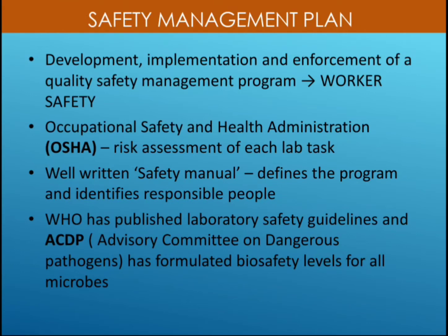Development, implementation and enforcement of a quality safety management program. Then the Occupational Safety and Health Administration, also called OSHA, requires risk assessment of each lab task. Then there should be a well written safety manual which defines the program and identifies the responsible people.